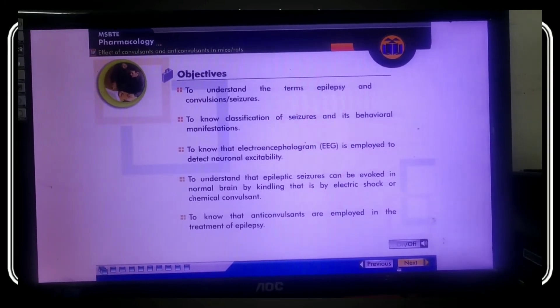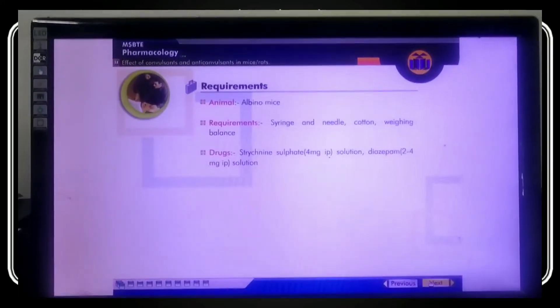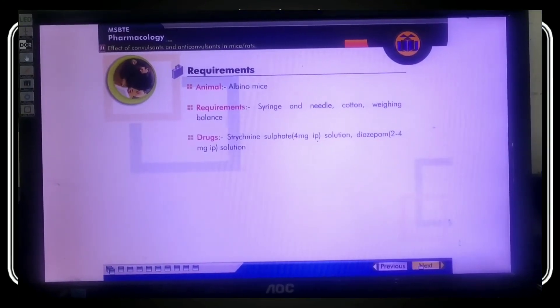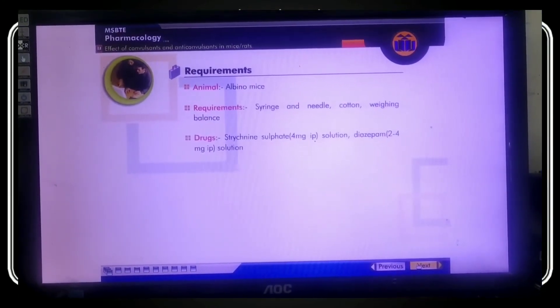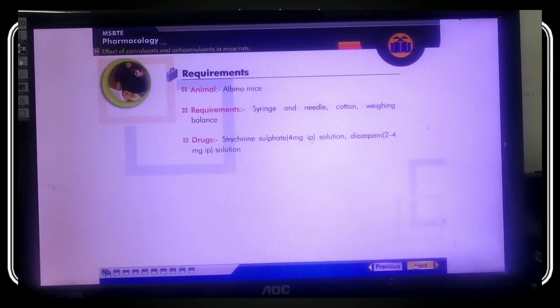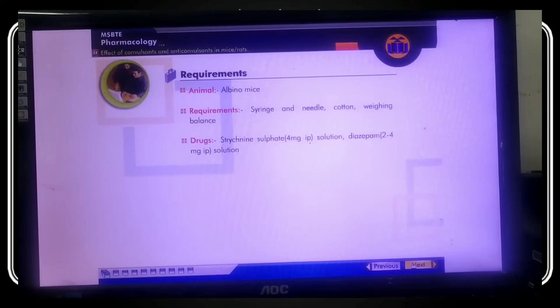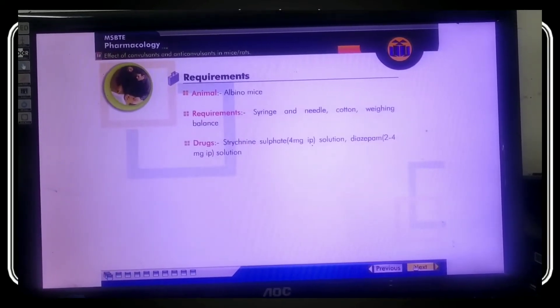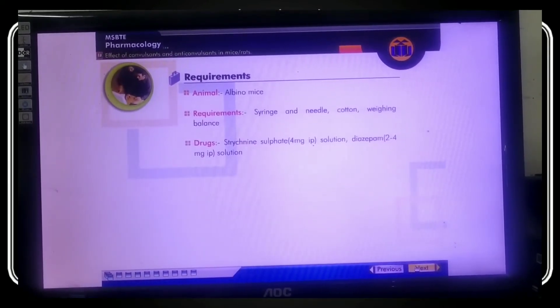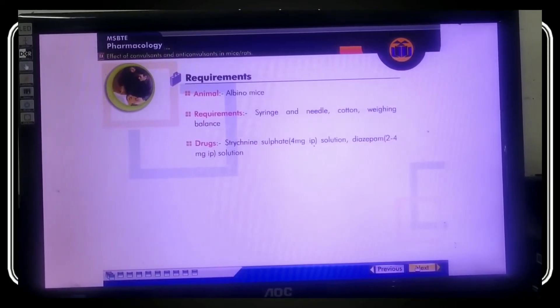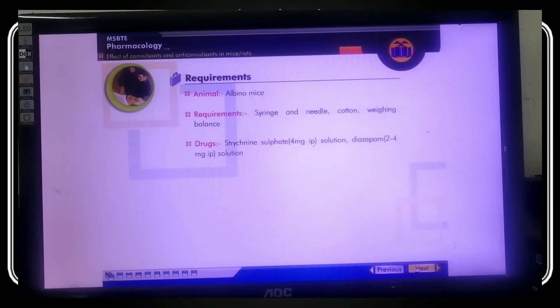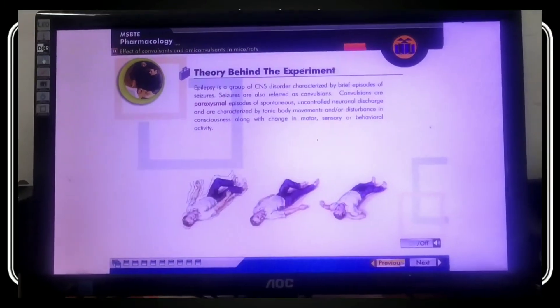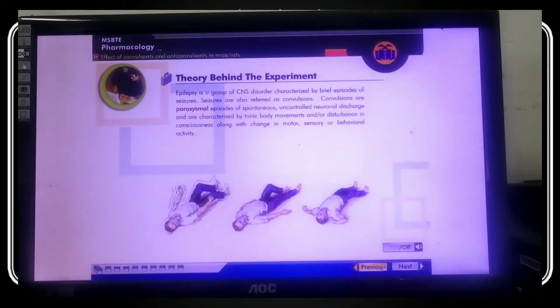The requirements for this experiment are: animal - albino mice; requirements like syringe and needle, cotton, weighing balance; drugs - strychnine sulfate 4 mg as per IP solution, and diazepam 2 to 4 mg IP solution.